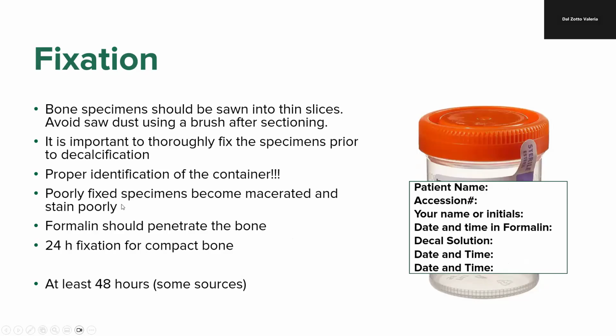Poorly fixed specimens become macerated and stain poorly. We said that. Formalin should penetrate the bone first and then the decalcification solution. So allow 24-hour fixation for compact bone. For some sources, books, resources, sometimes it is 48 hours, but we don't use this.